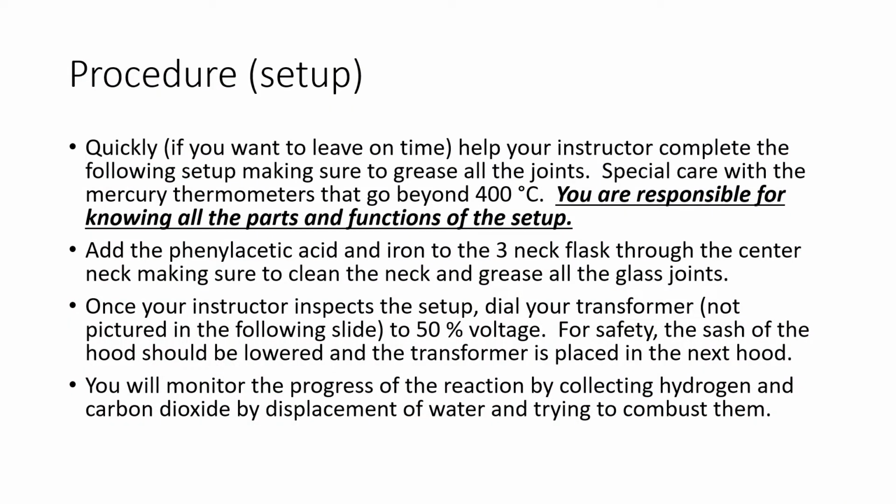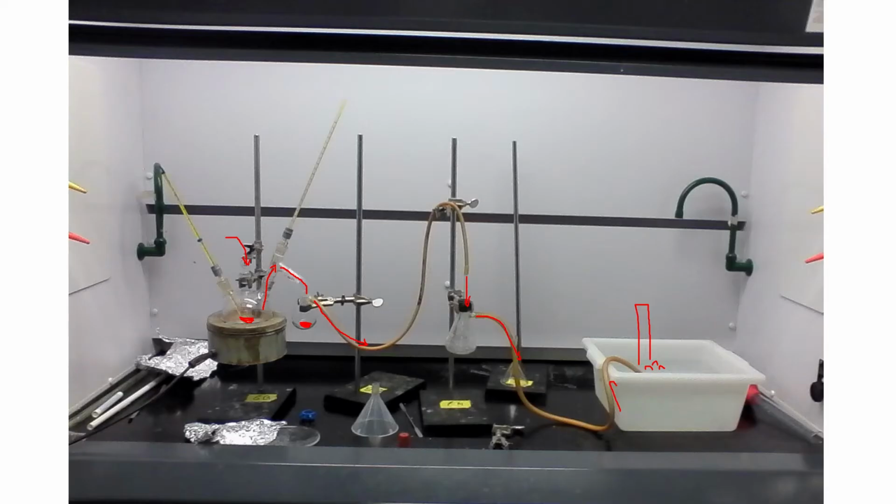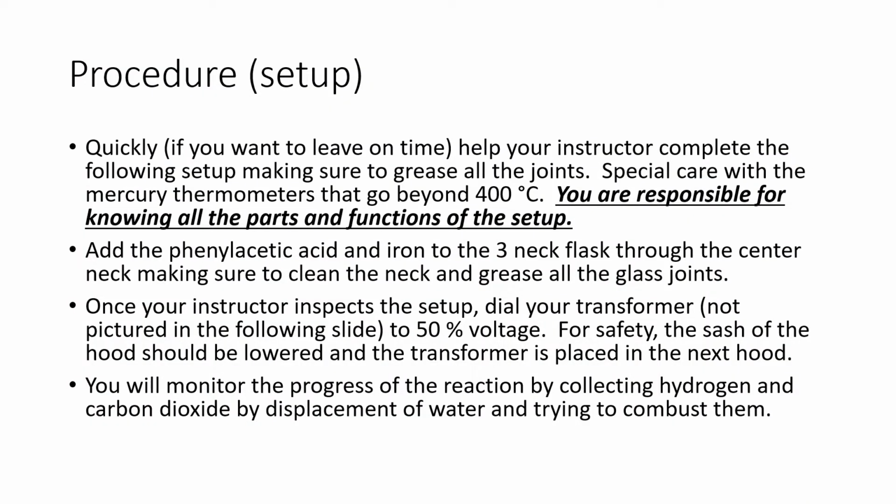So let me just make sure. Yes, so you'll add the phenylacetic acid into the middle of the 3-neck flask, so right here, as well as the iron, and just make sure that when you add it that the neck is clean. You don't want to add grease into the system or into the reaction.